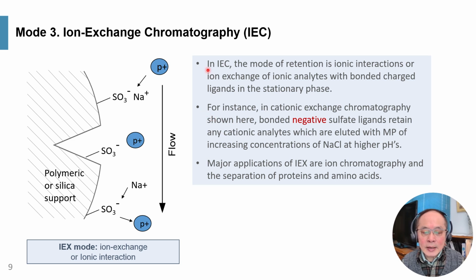Okay, in IEC, the mode of retention is ionic interaction or ion exchange of the ionic analyte with the bonded charged ligands in the stationary phase.